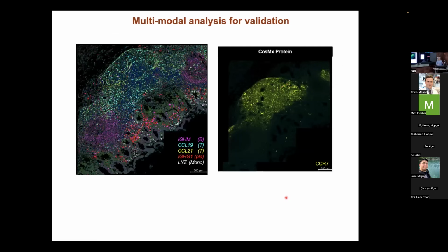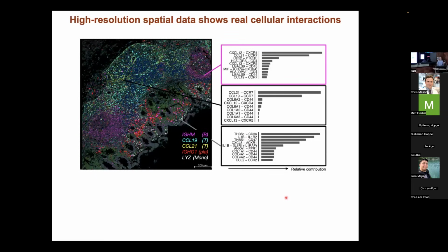And the thing that's different here is, if you really think about the interactions, when you do single cell RNA analysis, the ligand receptor interactions that you see, that's all imputed, right? You don't really know if the cell, if you see signaling and you think, oh, there must be some ligand receptor interaction with this other cell, you don't really know if those cells are actually in any spatial relationship with each other.